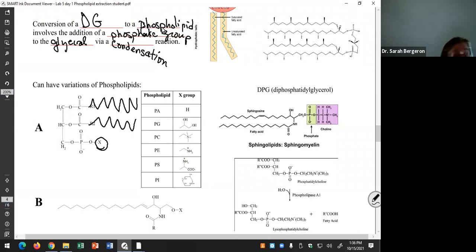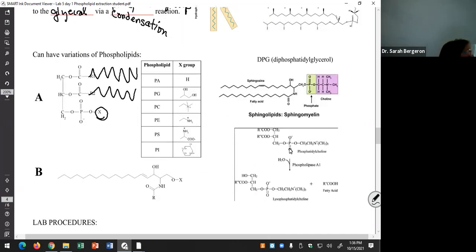Beef. You might find mouse, right? Mouse is a really common animal used in research. You might find human. It doesn't matter to me. Just find a mammal, right? Be pretty similar enough. A mammal's going to be similar enough. Yeah. You start changing the chemistry of the body system, you're going to start changing the lipid percentages, right?